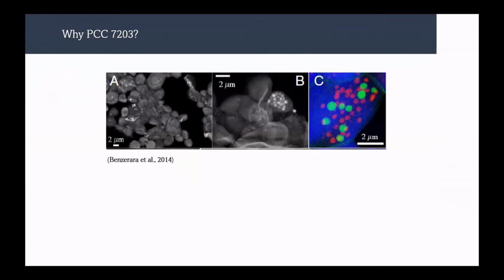Because this strain, they showed that they are able to form intracellularly amorphous calcium carbonate inclusions. So they are able to uptake calcium from this solution. So the idea is that maybe by uptaking calcium, they could do something similar to the mechanism that we noticed for the filamentous cyanobacteria strain. And so maybe this will tend locally to decrease the saturation state.